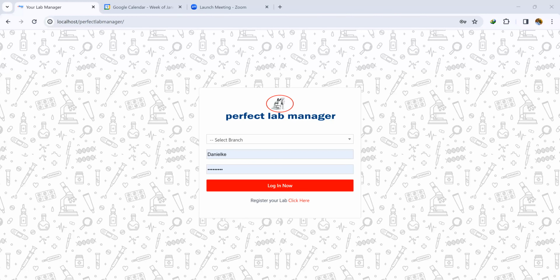Welcome to Perfect Lab Manager. Today I'll be taking you through the working space, or the interface. We'll be looking at the various features that the software or the platform brings to our businesses or our laboratory facilities, and then we'll see how best we can take advantage of these features.